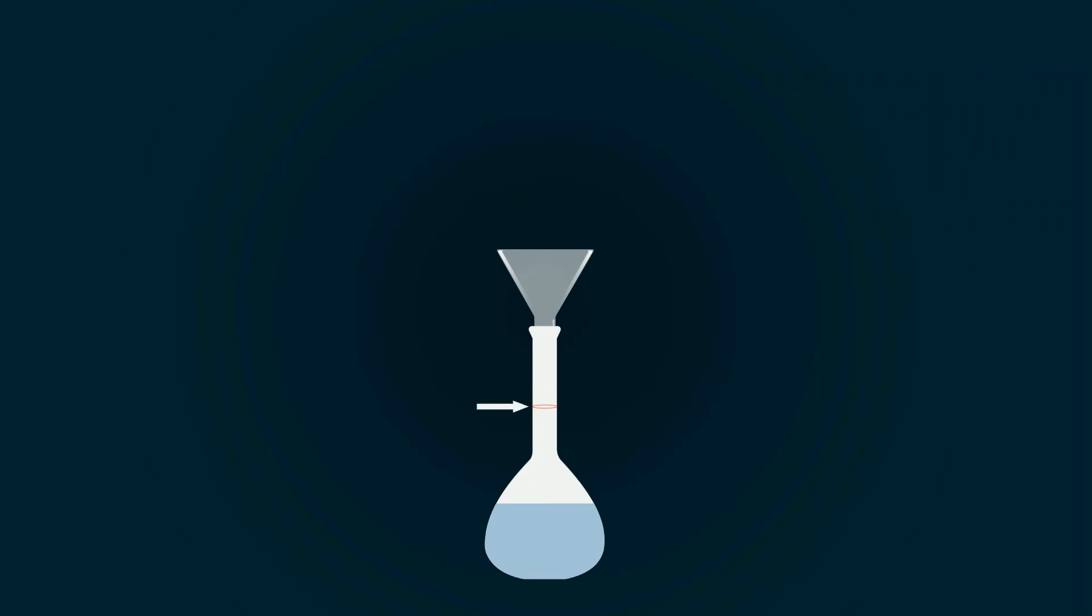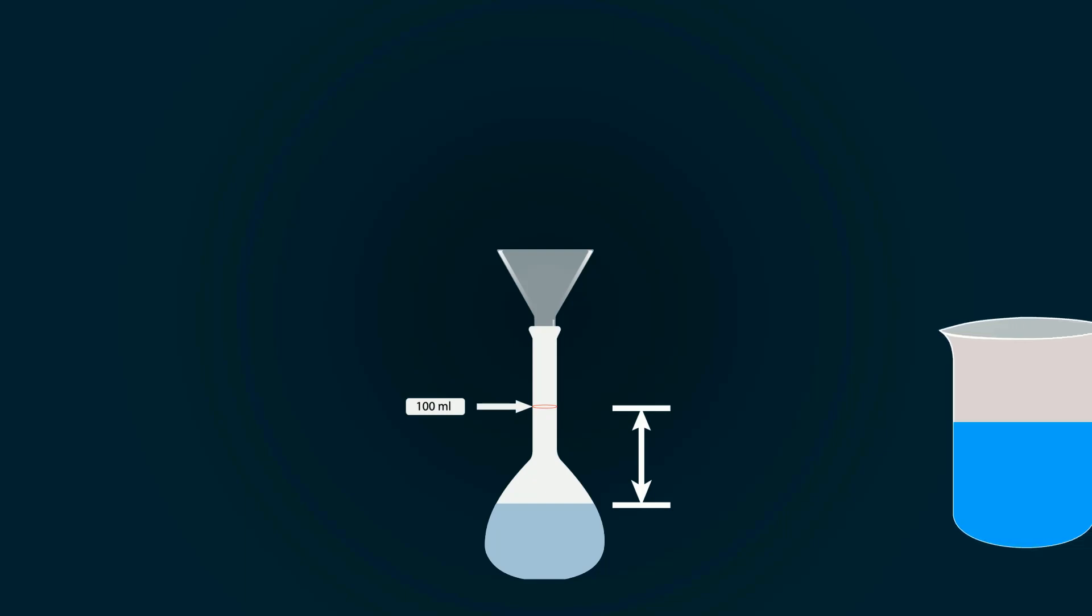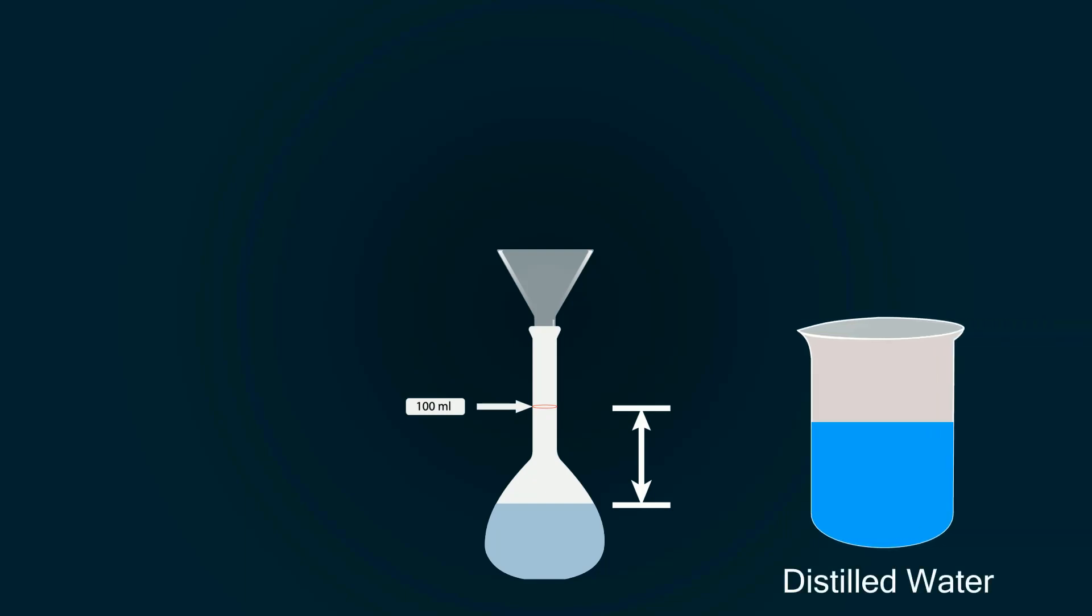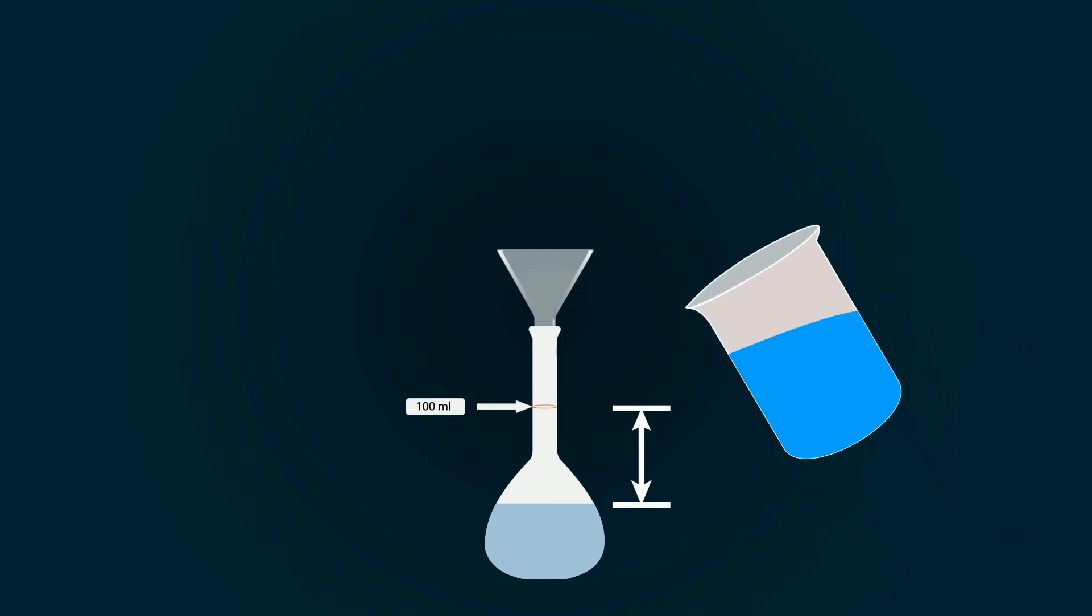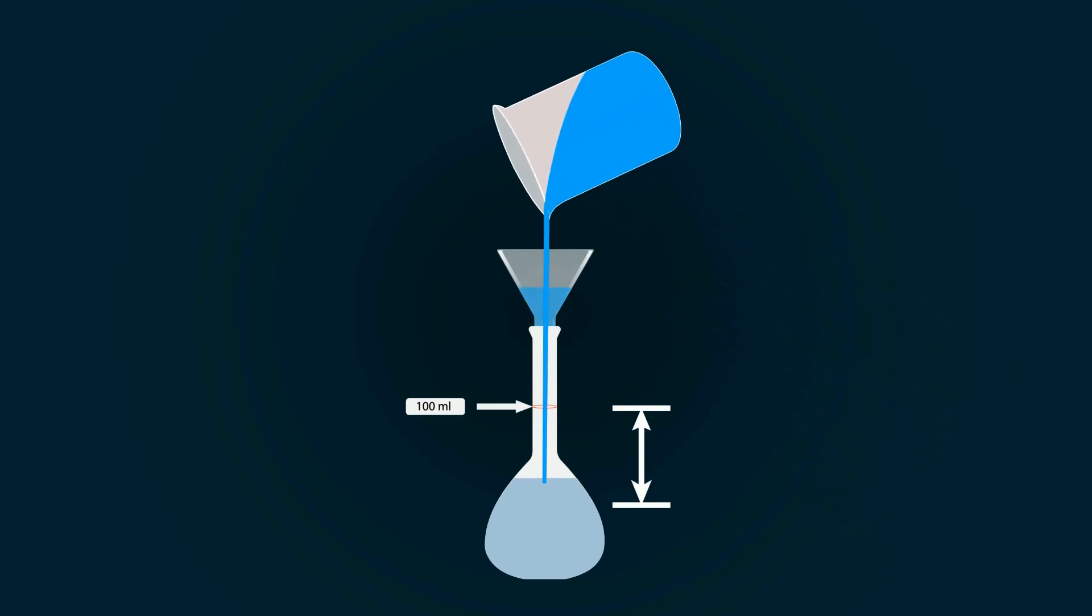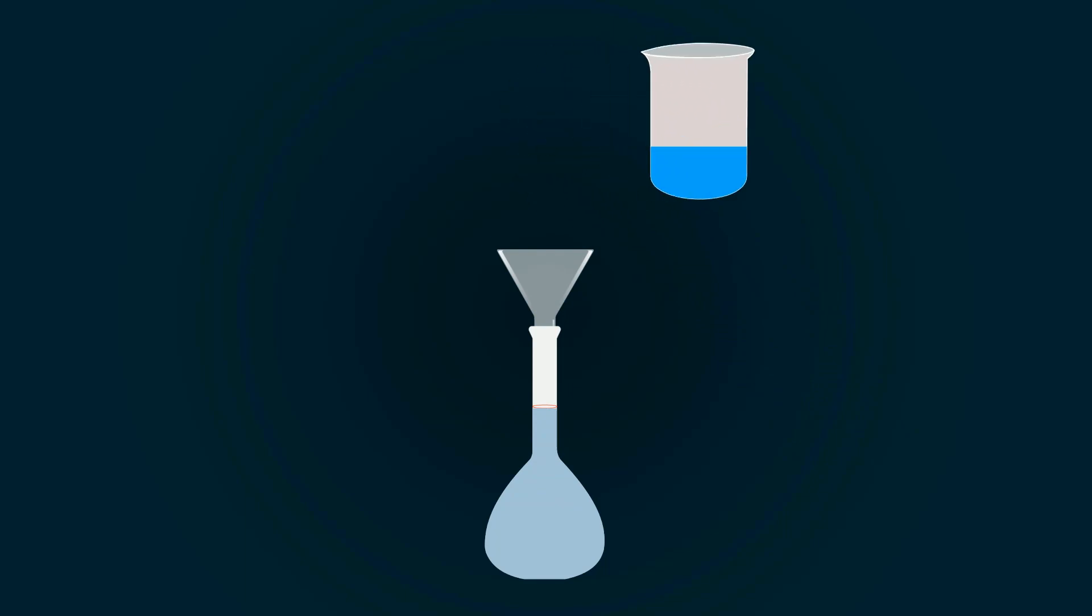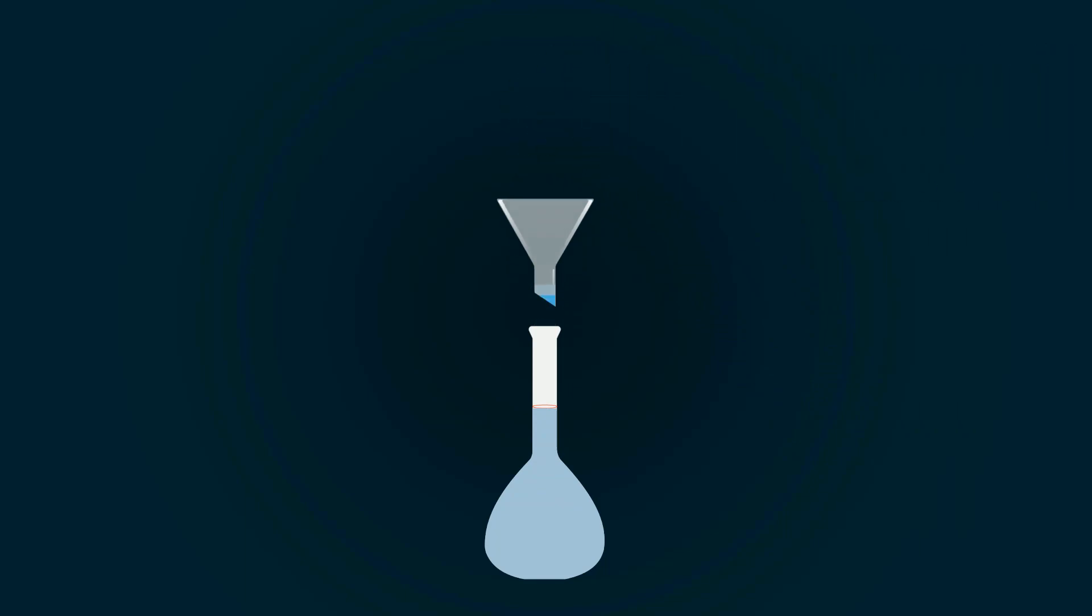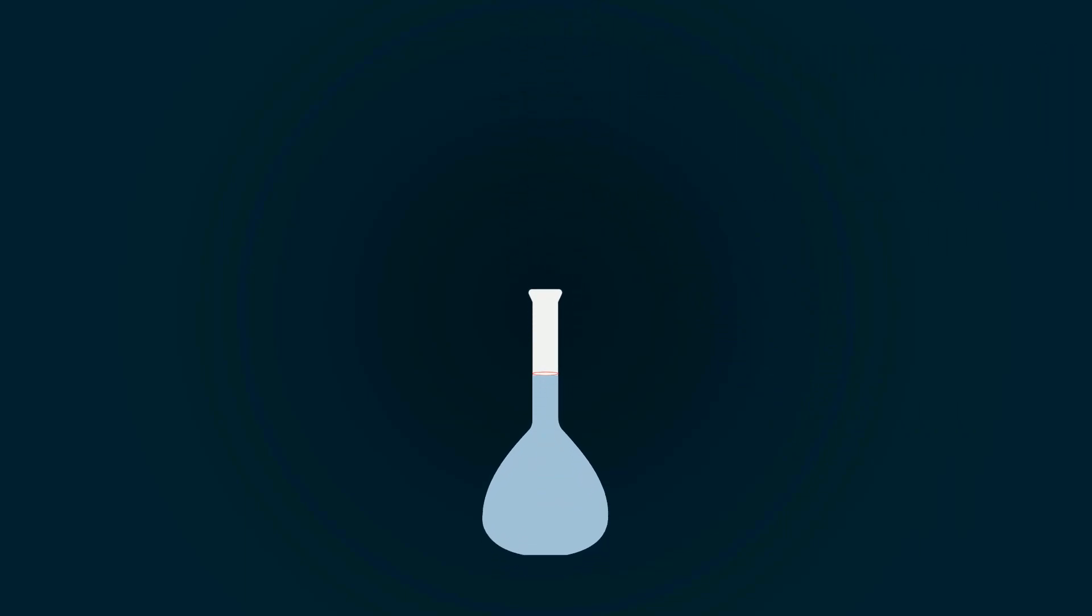You have to fill it up to the 100 milliliters point. For that, you have to add more distilled water in it. So, take some distilled water into an empty beaker and pour it into the volumetric flask to fill it up to the 100 milliliter point. You have successfully prepared 1% weight by volume starch indicator.